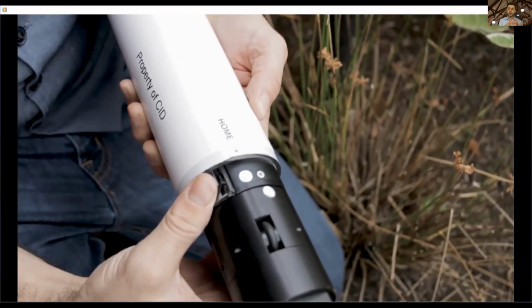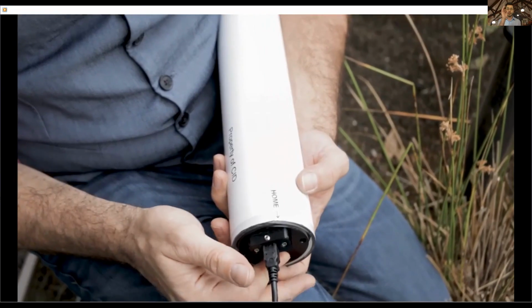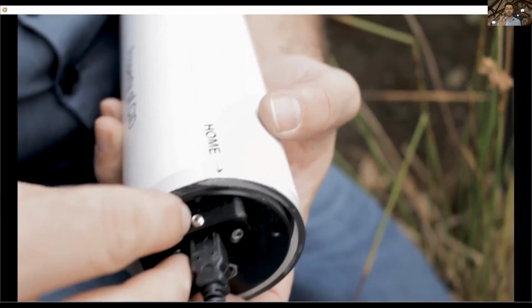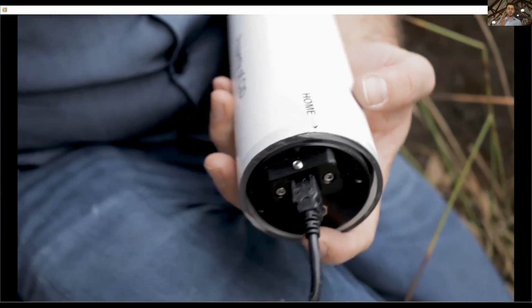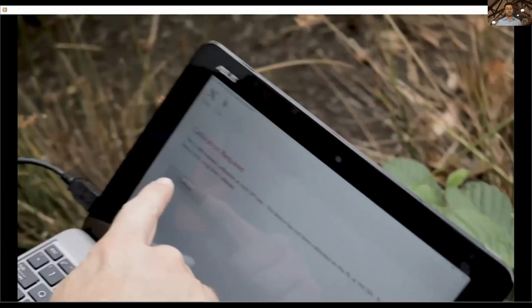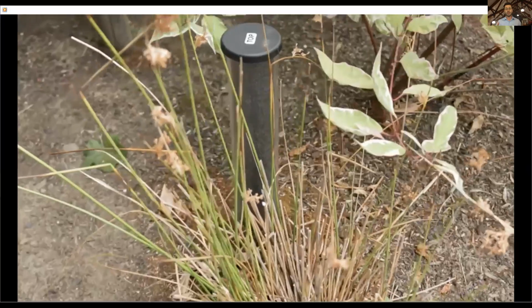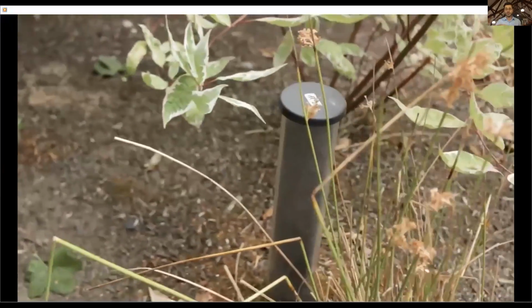And we do suggest that when you're doing your individual tubes, you utilize those two dots as well, marking it at each one of the tubes. That way, when you're doing your scans and you're placing it in, you're getting the exact same scan location every single time. We find it just makes research and data a lot easier. It's not a complete detriment if you don't, because it is a 360-degree scan.